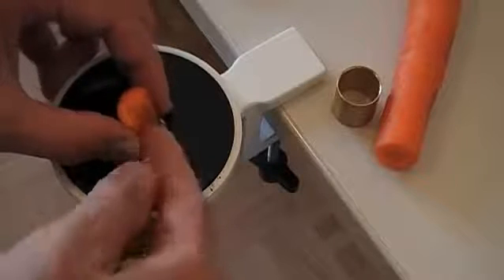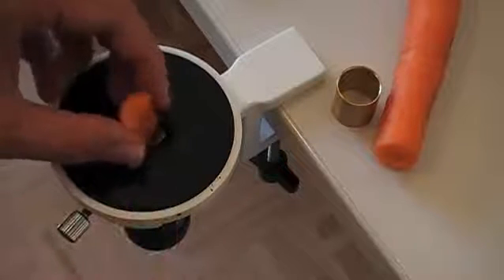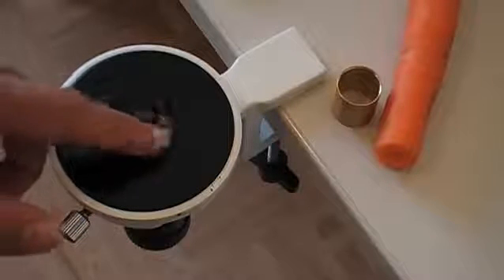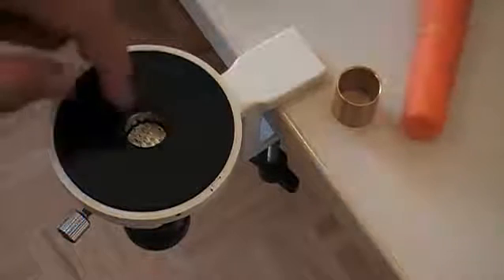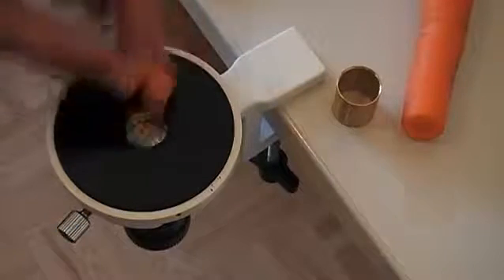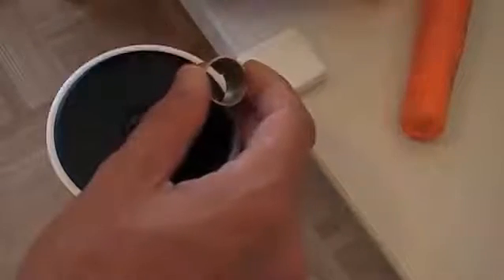What some people do is add padding material left and right — for example, styrofoam, which I would definitely not recommend because it really makes the knife dull very quickly. Some other people use an elderberry marrow from the center of an elderberry stem. But generally, this microtome is designed to accept samples embedded in paraffin. Since I don't have that, we somehow have to manage to put the carrot right into the center here.